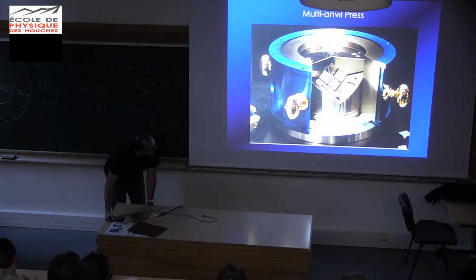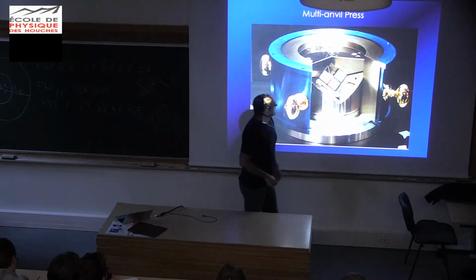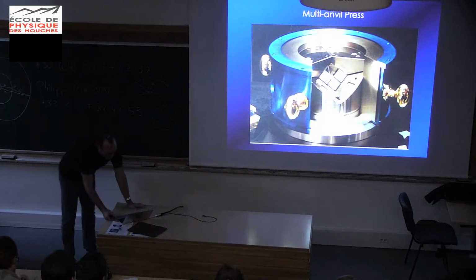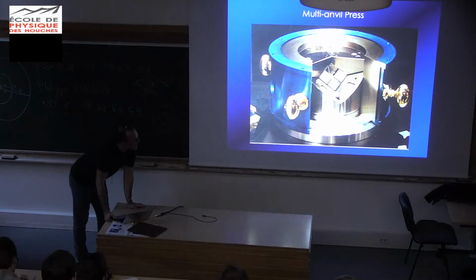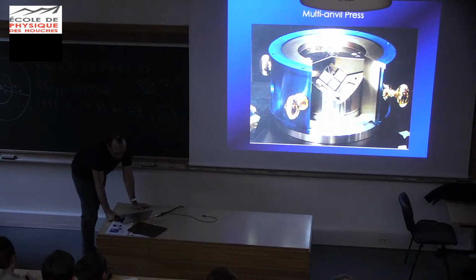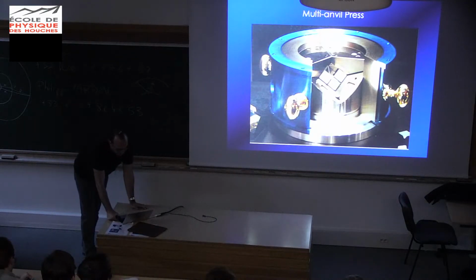All right, so that's the end result. The only thing that's missing here is the 6th primary anvil. Actually, I think there's also a cube missing. And above all, this won't work because it's open. But that's the basic principle. So you're transforming a uniaxial load into a 6-axis load that is going to come and push on 8 little cubes. All right? And inside the octahedron, the assembly is basically identical to the piston cylinder assembly.